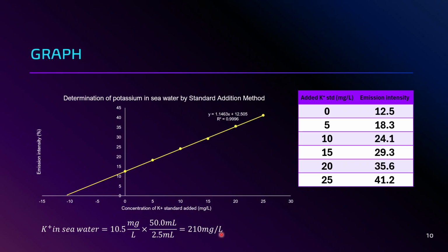Okay. But if you have a limited time, or you have limited resources, such as, if you are talking about seawater, we have enormous amount of sample. But think of yourself in a situation where you are going to analyze blood sample of a patient.